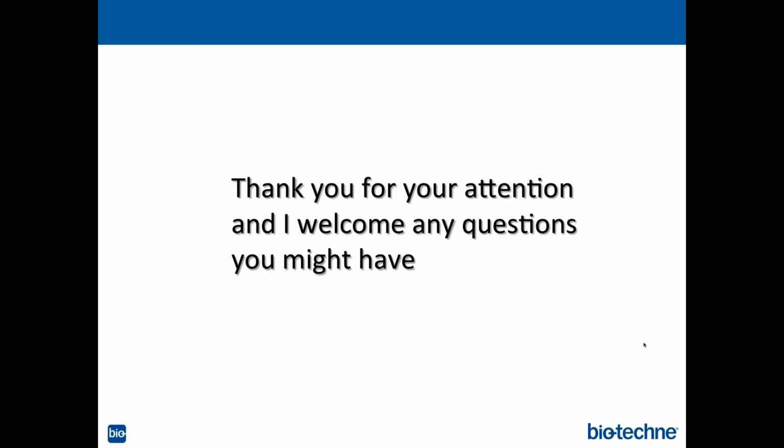Well, when you were talking about the goat polyclonals, I thought that you could possibly mimic goat polyclonals by making a defined mixture of several monoclonals selected from the original polyclonal producing goat. Have you ever tried that?